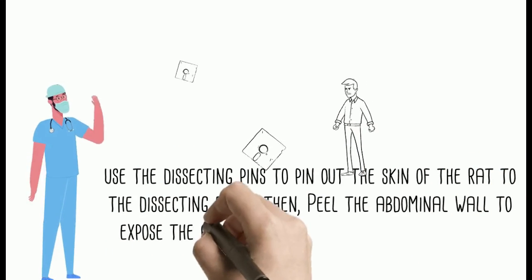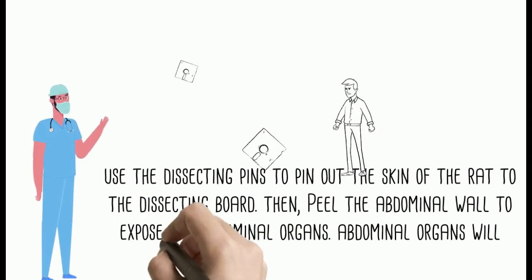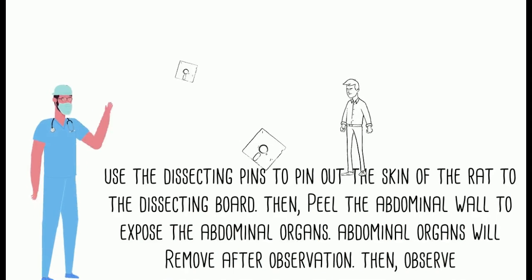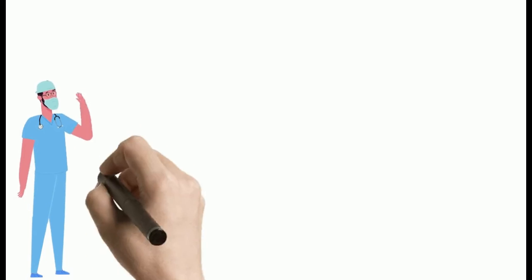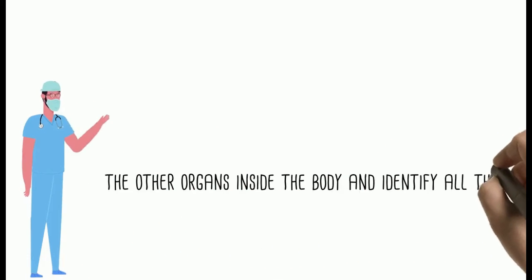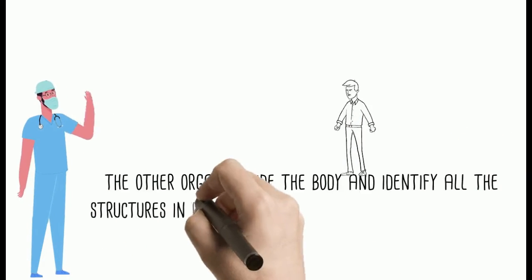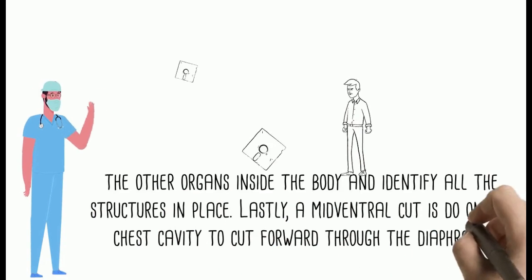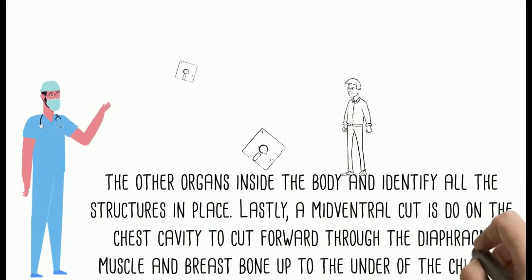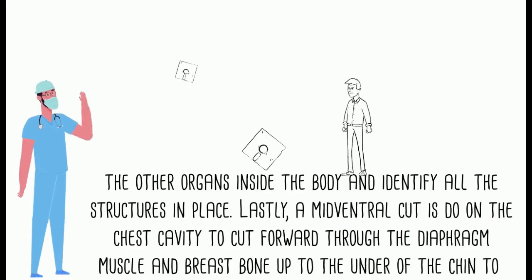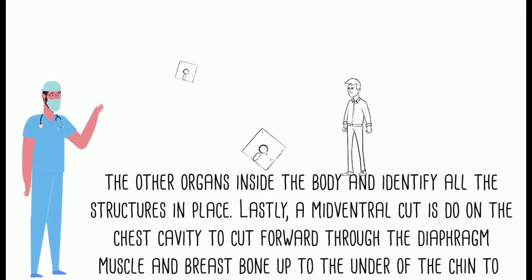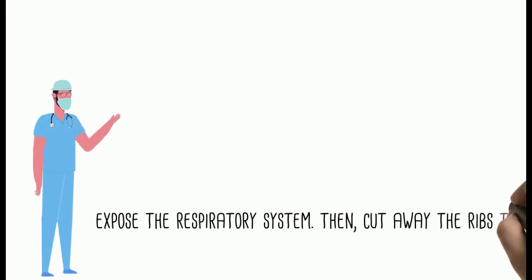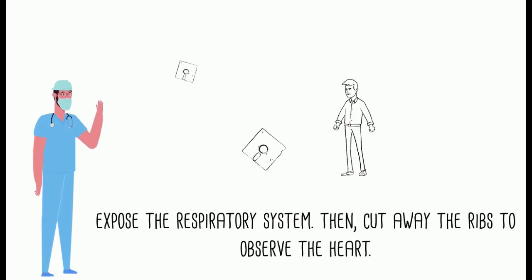Peel back the abdominal wall to expose the abdominal organs. The abdominal organs will be removed after observation. Then observe the other organs inside the body and identify all structures in place. Lastly, a mid-ventral cut is made on the chest cavity, cutting forward through the diaphragm muscle and breastbone up to the underside of the chin, to expose the respiratory system. Then cut away the ribs to observe the heart.